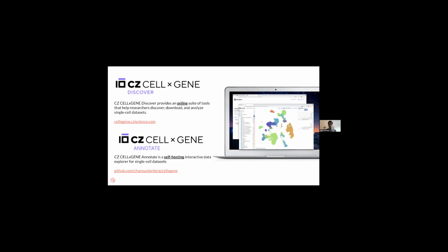We have two different flavors of CELLxGENE. One is called CELLxGENE Discover, and the other one is called CELLxGENE Annotate. CELLxGENE Discover is an online suite of tools and also a data repository that lets you discover, download, and analyze publicly available data. We also host data for free. So if any of you have any single cell datasets that you want hosted online, we provide that service as well.